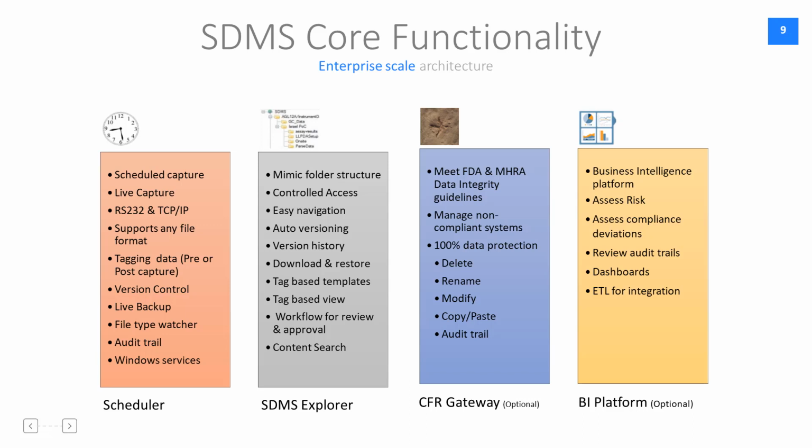CFR Gateway is a very important, very unique tool developed by Agaram Technologies. There are many instruments out there in several laboratories across the world which do not have appropriate access controls, CFR Part 11 related controls. How to handle such instruments?